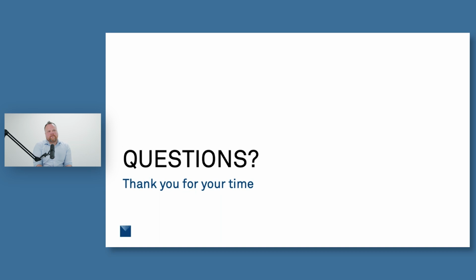So using it in the field is usually problematic. We have had a couple of people that have a field shed that's somewhat climate controlled, and you can use it in that kind of instance. But the biggest issue that you're going to run into using it in the field is climate stability. So if you're running it for a couple of days, and you have large temperature swings between day and night, it's going to cause a lot of variation in those readings, which can cause problems.